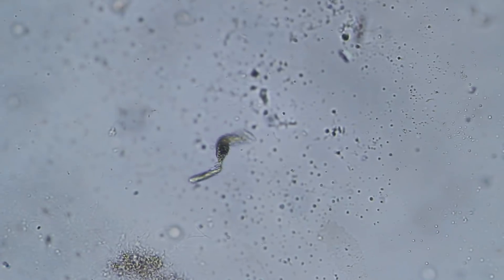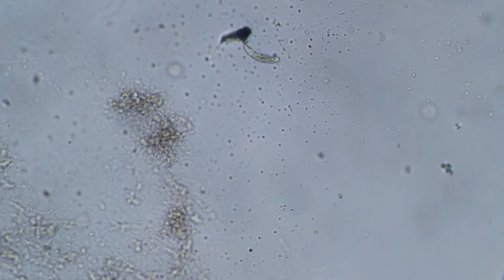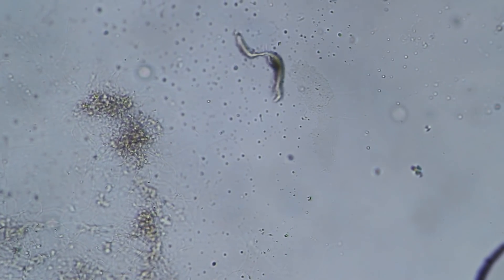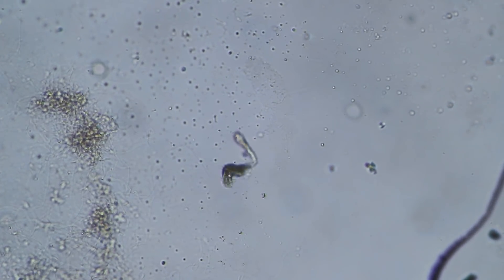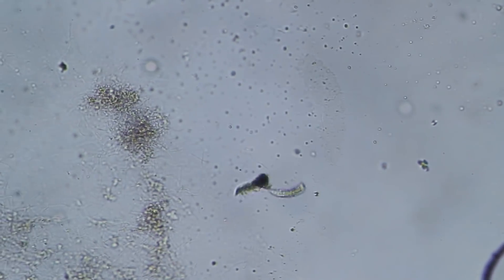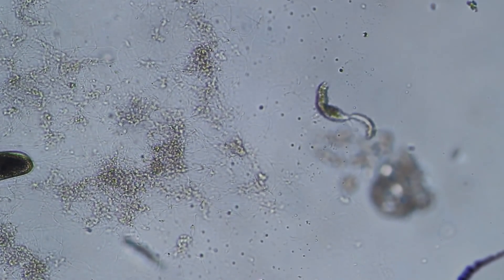It's starting to spin even. It's kind of fascinating to see all of these processes right under the microscope. If you want to see this more often, you can always try to add a little bit of salt — this makes the cells shrivel up. I tried citric acid before. You can add all sorts of things. Alcohol dissolves the cell membrane. So lots of fun stuff that you can try out and see what happens to the cells.